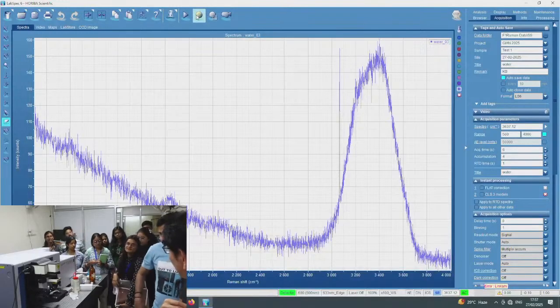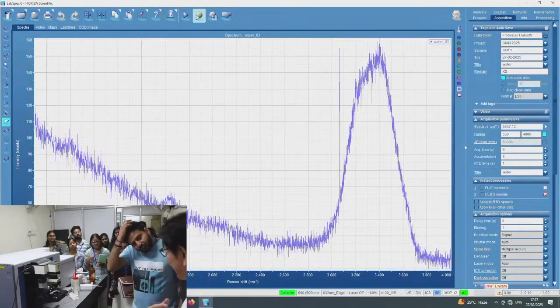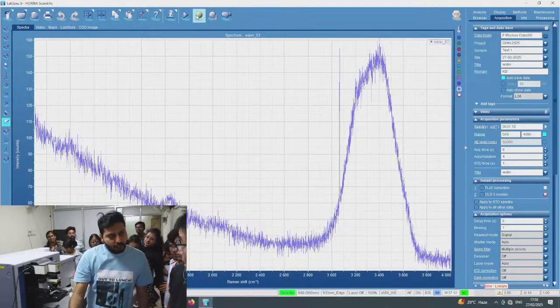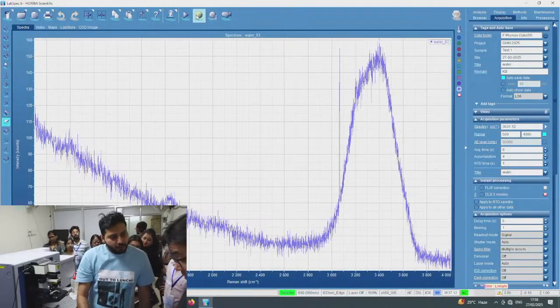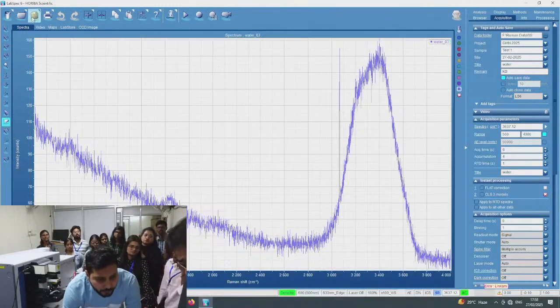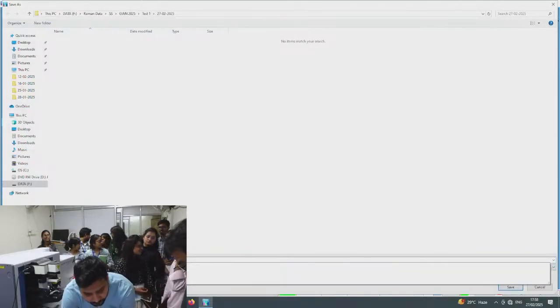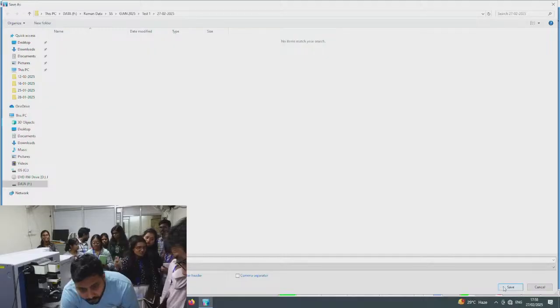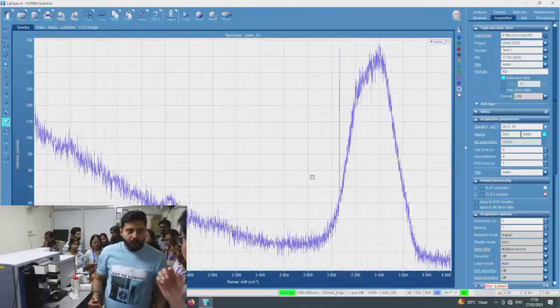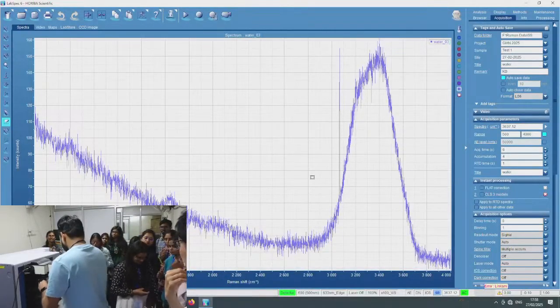Okay. So they change it with spectral solution? Okay, would you save this data? Yeah. So in this way, or we can do the baseline correction here only. So should we do the baseline correction? As it is. As it is. And then move to the next solution. Let's move to the next sample.